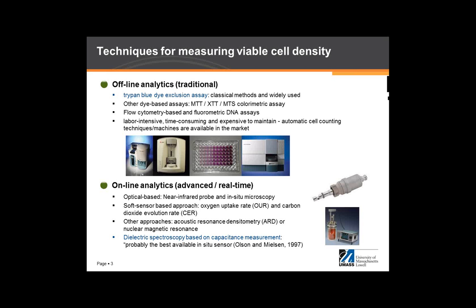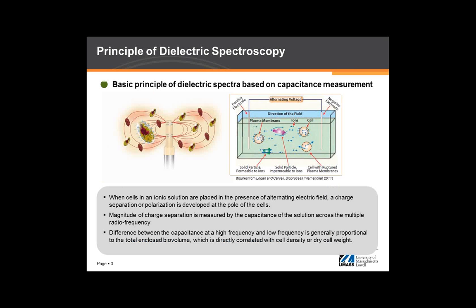Then, in conjunction with the process analytical technology and quality by design initiatives by the FDA and European agencies, I think those real-time technologies will be way more significant compared to the current status. So this online technology is the one that we're going to be focusing on today. The technology we are focusing on here is called dielectric spectroscopy. And as you know, this technology was initiated by Aber Instruments.